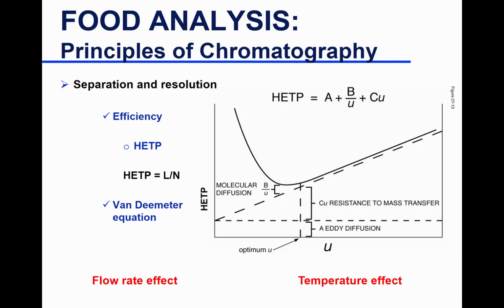Okay, so longitudinal diffusion is basically the diffusion going from highly concentrated to less concentrated, going downward through the column compared to going into your mobile phase. So equilibrating between stationary phase and mobile phase is one movement. Another movement is diffusion, going down by diffusing. The more the solute diffuses, then you also end up with a wider peak.